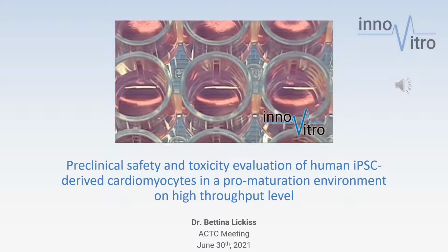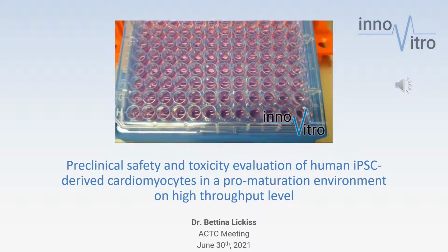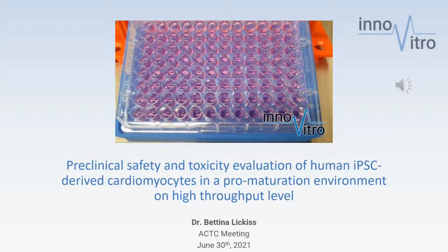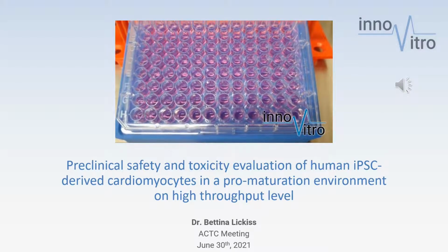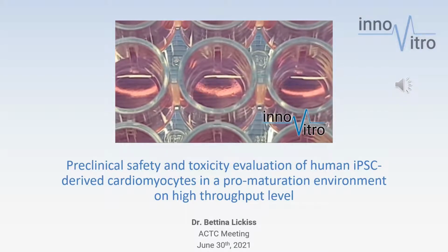I'm happy to be here today at the ACTC meeting to show you how you can perform modern preclinical safety and toxicity evaluation using human iPSC-derived cardiomyocytes in a physiological environment on high throughput level.